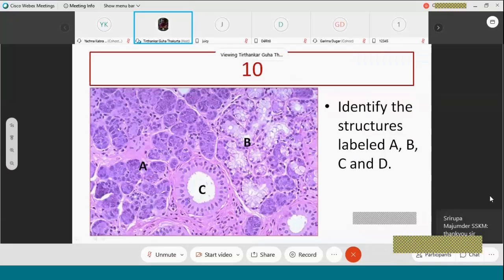Okay, so now I will show you biopsies or histopathologies or histologies of different organs. There is no pathology in the organ. These are all normal organs. So you will try to deduce what organ that is. And to help you, I might give you a hint, not by naming the organ, not by giving any hint of the function of the organ.